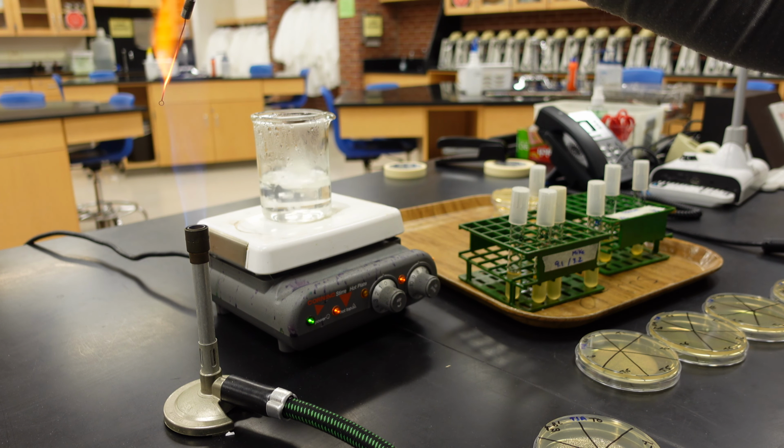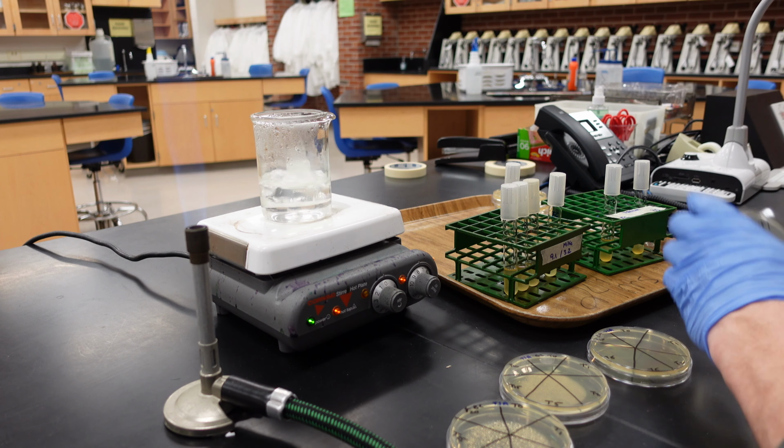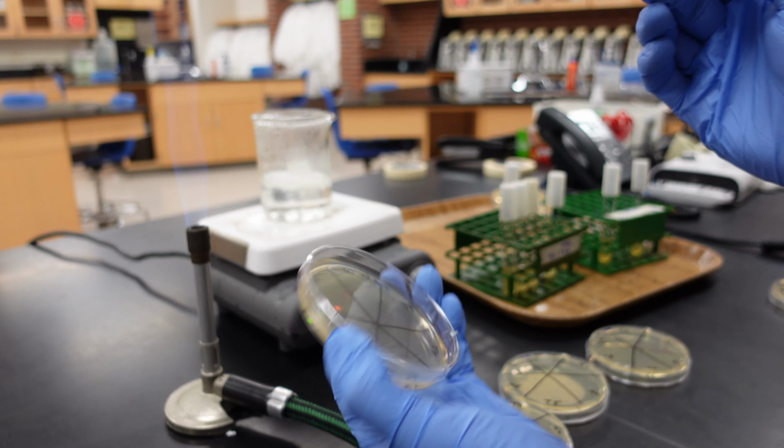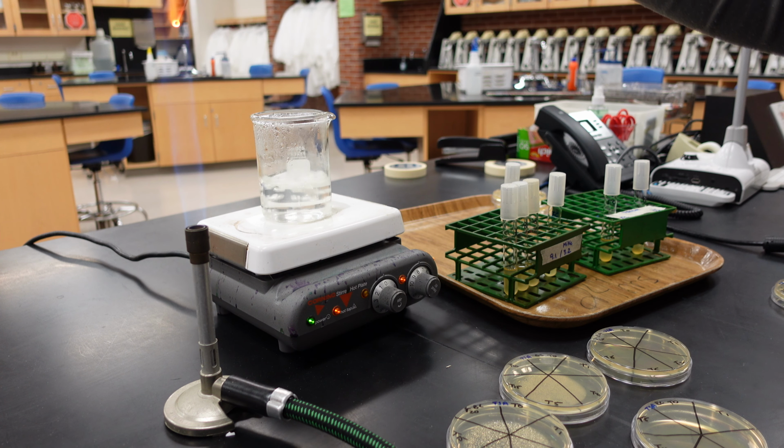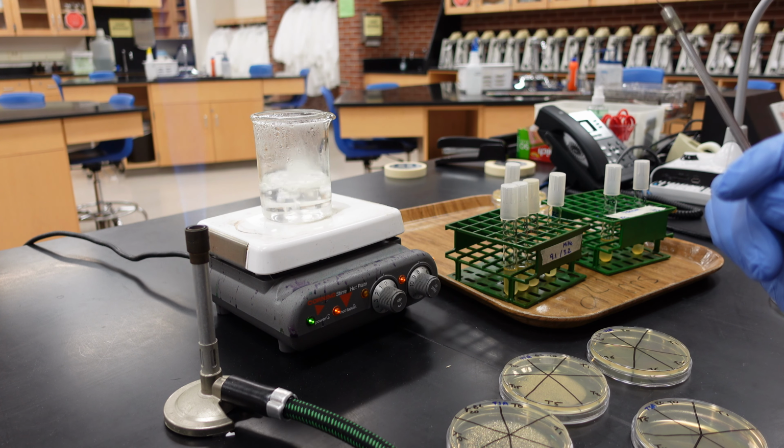I'm going to repeat that for all of the samples, and then we have the last one, the E. coli. So you should have formed a hypothesis for the E. coli in heat and the Bacillus in heat. Propose an explanation. What do you think will happen after 1 minute, after 2 minutes, after 5 minutes of the bacteria being exposed to the boiling water?